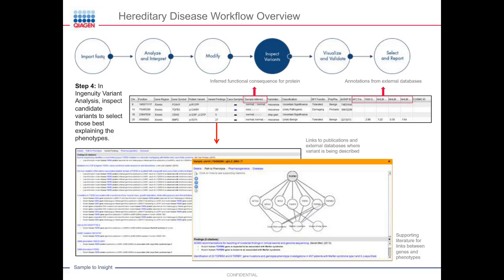Our next question asks, how does the workflow automatically choose the correct genetic scenario? It does not. So the workflow tests all scenarios. It tests for dominantly inherited mode of inheritance. It also tests for compound het variants, compound heterozygote mode of inheritance. It tests for de novo case and for homozygote recessive case.